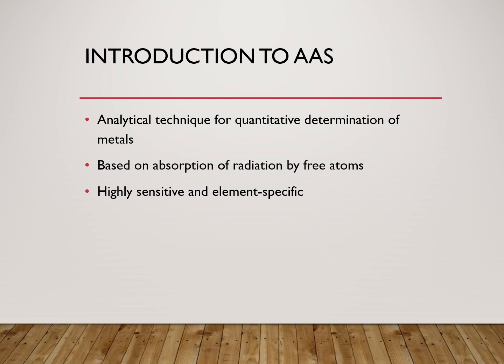Now, atomic absorption spectroscopy is a powerful analytical technique used to determine metal concentrations at trace and ultra-trace levels. We can determine the concentration at a very minute level.